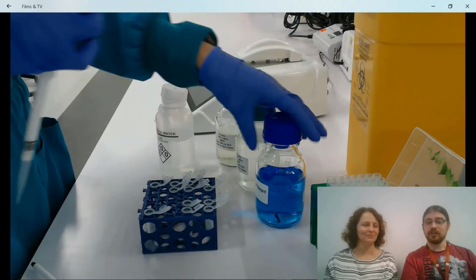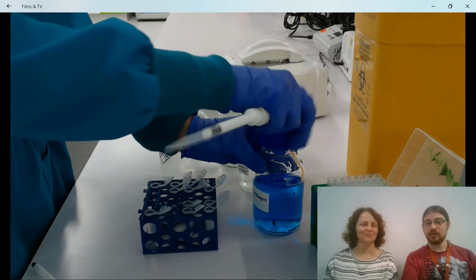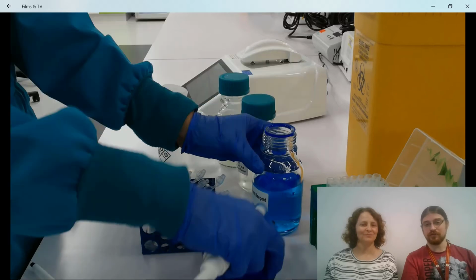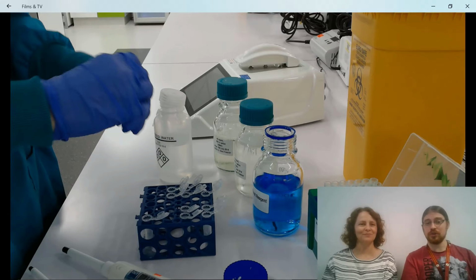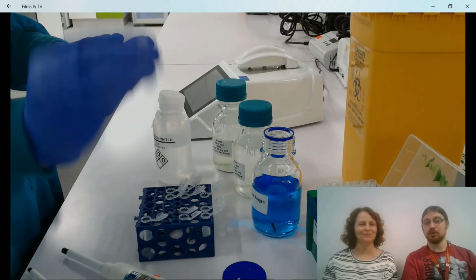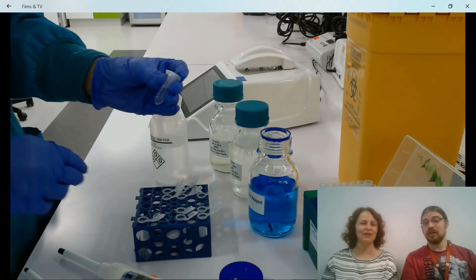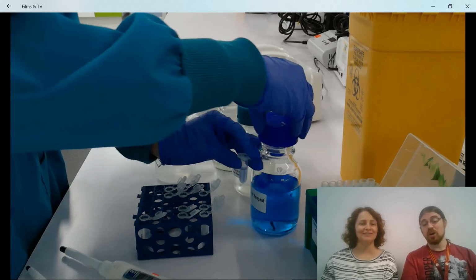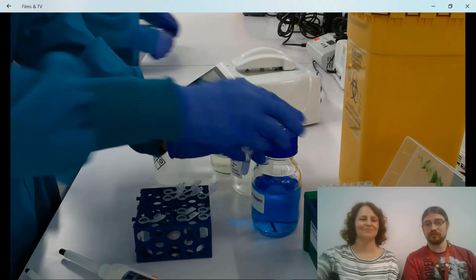And finally, 1 milliliter or 1,000 microliters of the Biuret reagent. Now, make sure you seal the tube and give it a good mix. And there you have it, your sample's made.